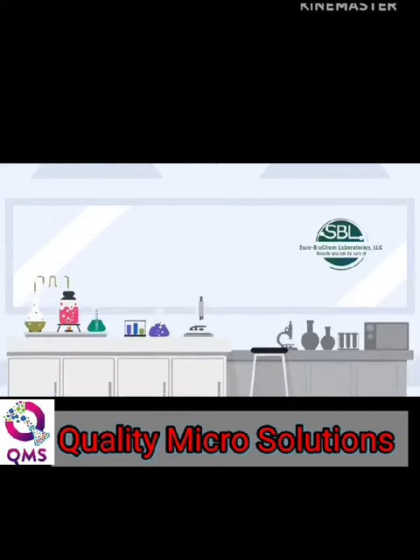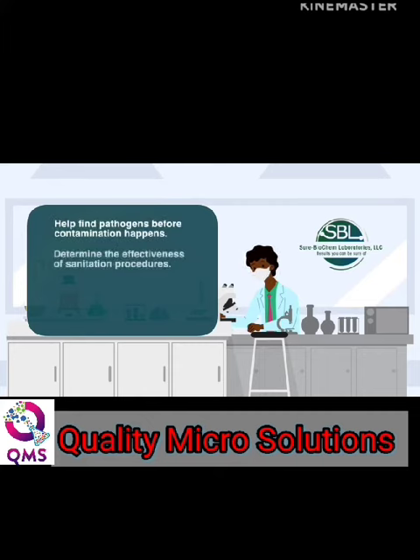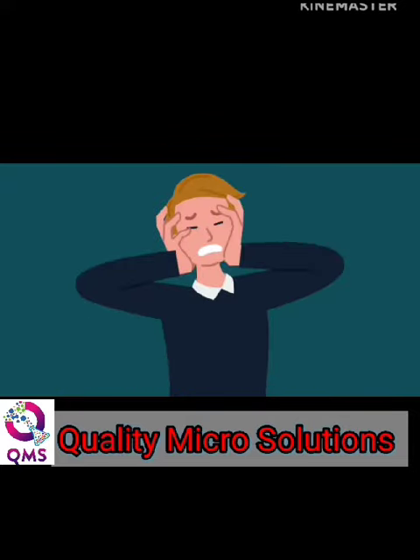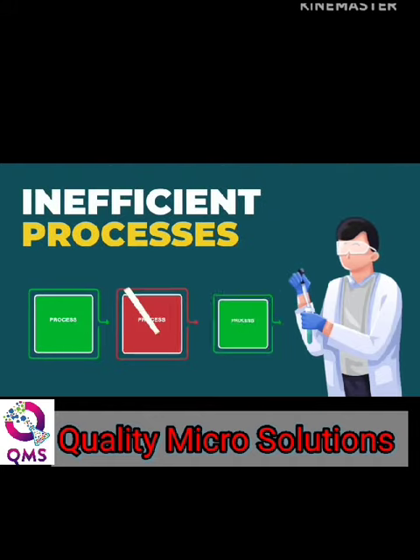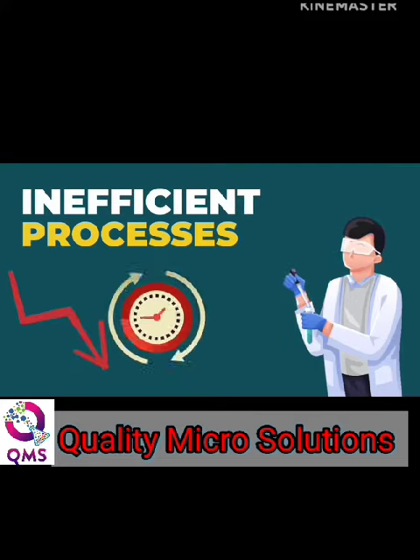An environmental monitoring microbiology program is important because it can help find pathogens before contamination happens. It can also determine the effectiveness of sanitation procedures, provide water sample testing, ensure compliance, and much more. Here are some of the biggest challenges of environmental monitoring microbiology. Inefficient processes. Even when environmental monitoring techniques are in place, companies still have to focus on reducing cycle times.